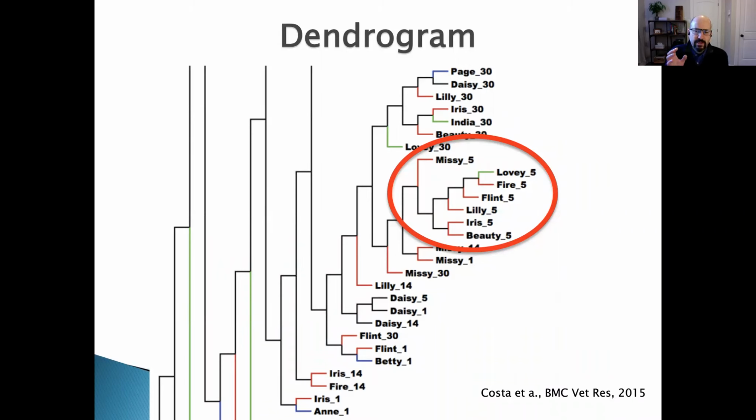Yes, they are made from the same data set using different types of calculations, but if they are coming from the same data set, they normally agree. So if you see a clustering here in the dendrogram, you should see a clustering in the PCOA, even though the type of analysis that they use to generate the plots are different.